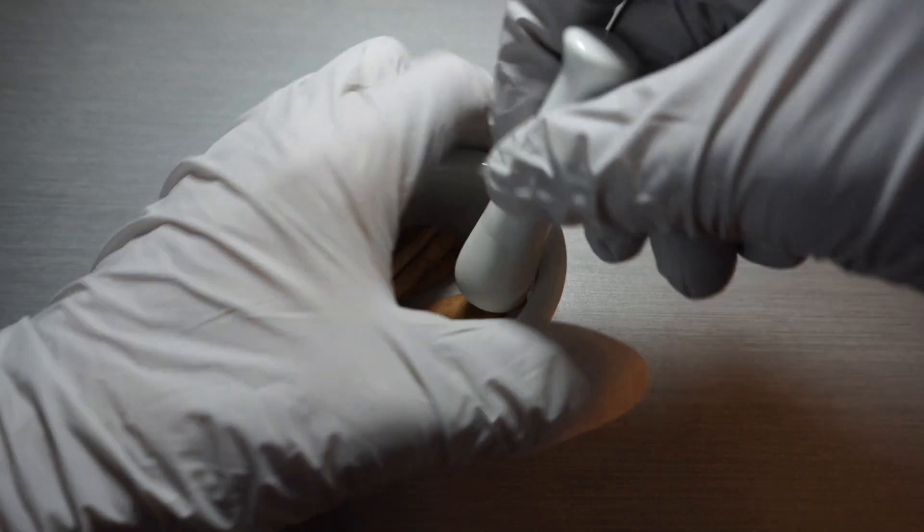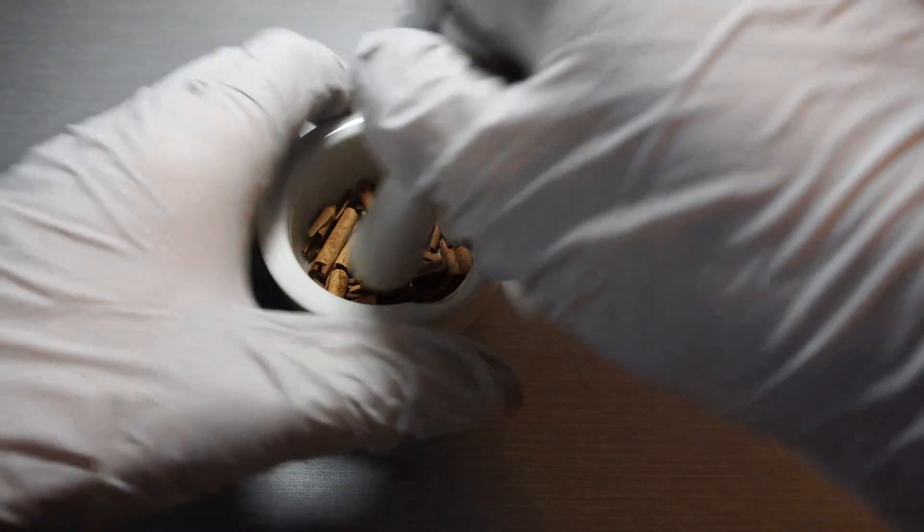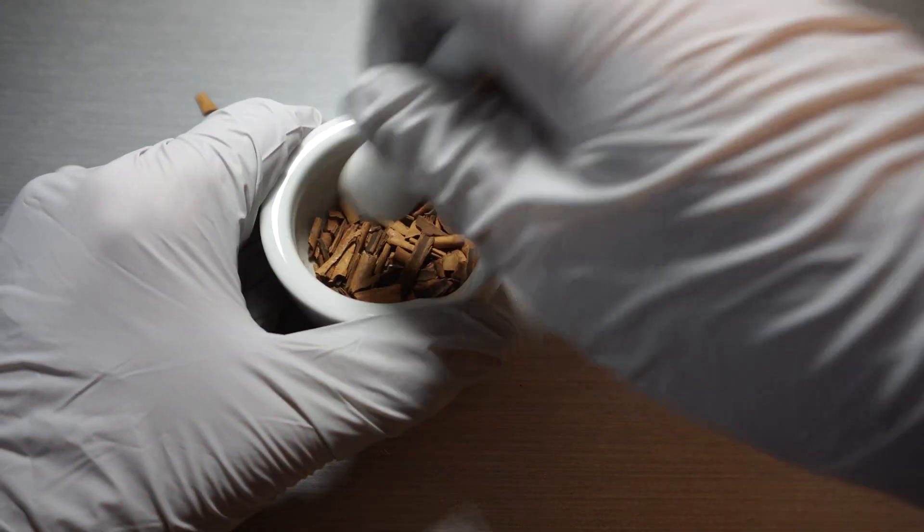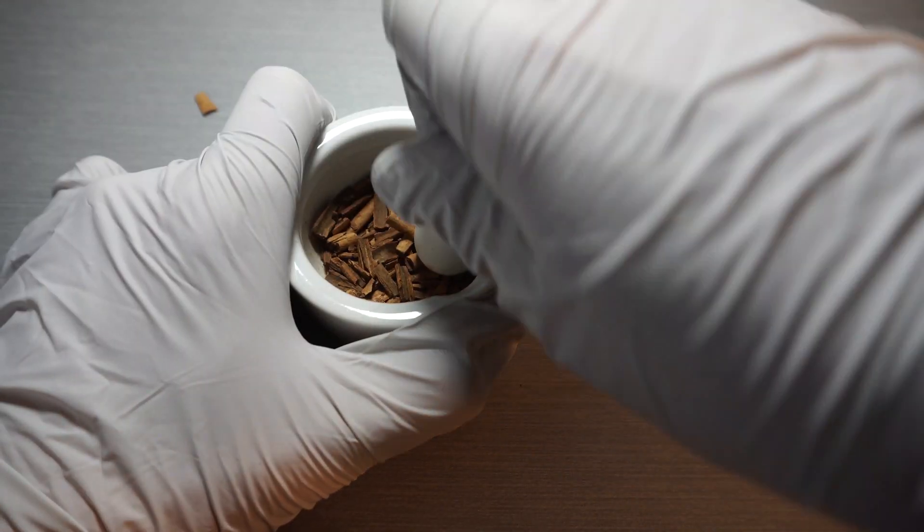Today, we will be using the method of hydrodistillation to pull the cinnamaldehyde from the bark of the cinnamon tree. To do that, we must first process the cinnamon down to be able to fit into a boiling flask. To do this, we start by breaking up the cinnamon using a pestle and mortar.